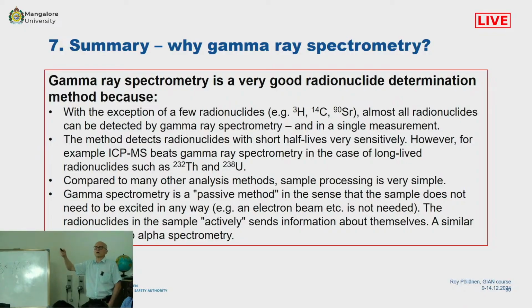However, the measurement time in some cases must be long enough. All right? The method detects radionuclides with short lives very sensitively.